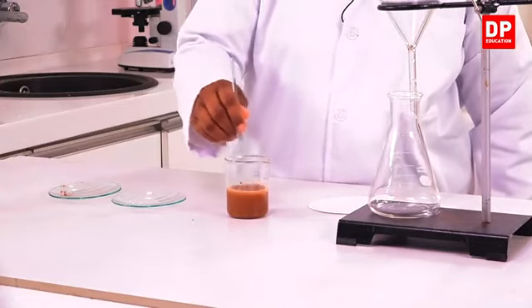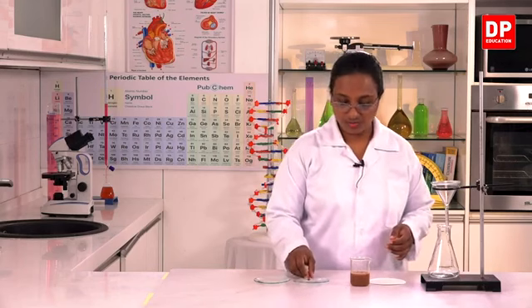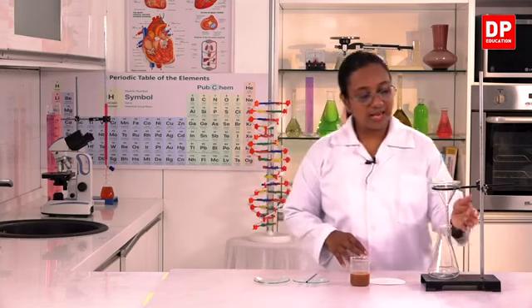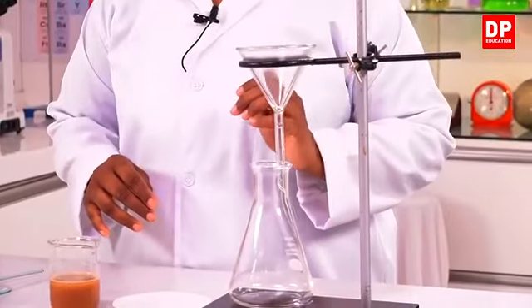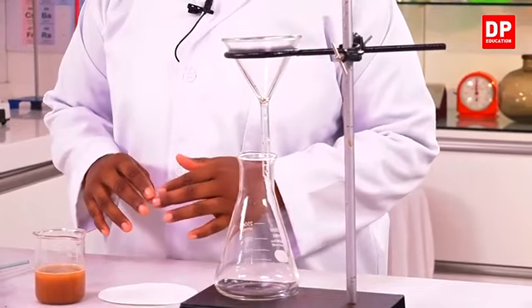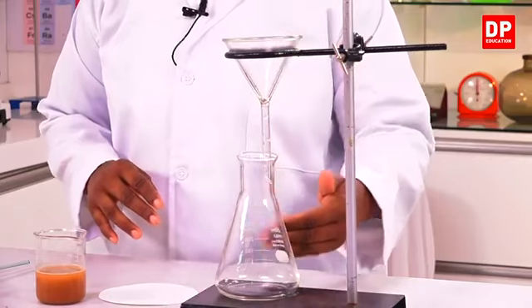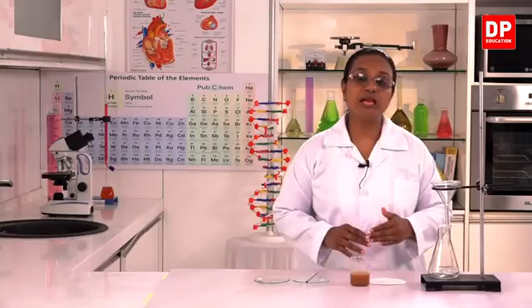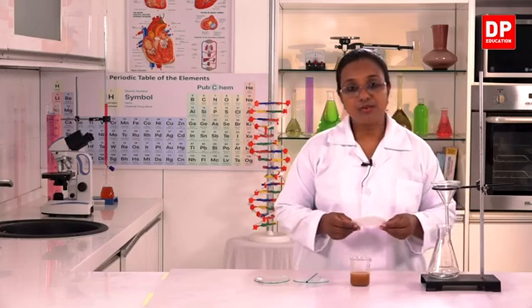So now we have a mixture in which we have the two solutes. So now I am going to carry out the filtration process. For that, I have the setup here, a conical flask to collect the filtrate. You can remember the term, students. The solution that comes into the conical flask is known as the filtrate, and what is going to remain in the filter paper is going to be the residue.